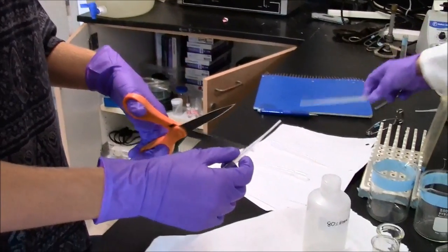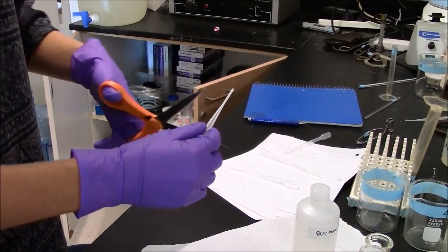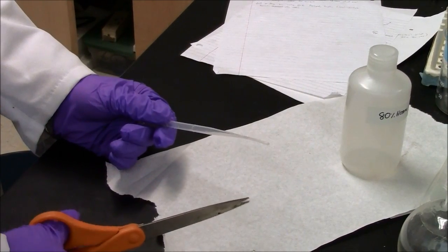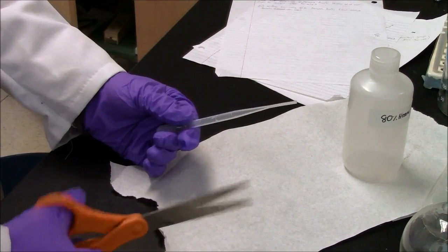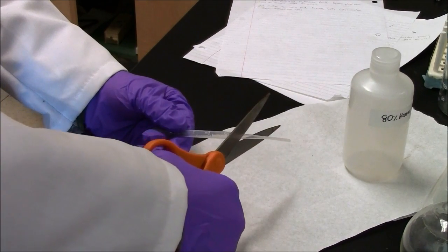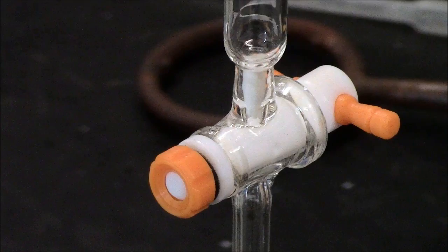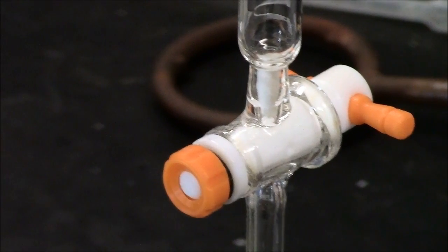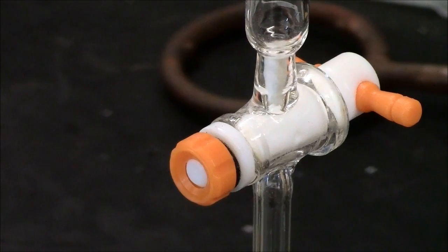We're going to use sawed-off pipette technology. So this is a normal plastic pipette, clean, brand new from the box. Alright, we're going to cut off the pipette so that it has a wider opening. Right about there. Okay, so that's how it should look. So here we have a column. At the base of the column there's a cotton plug that will keep the silica in the column while allowing solvent to go through.